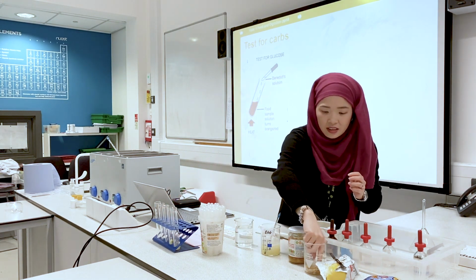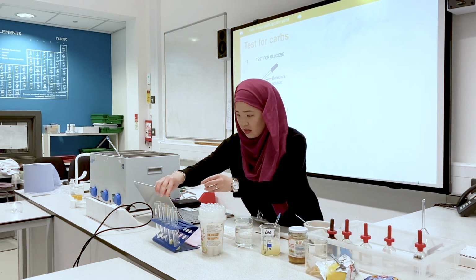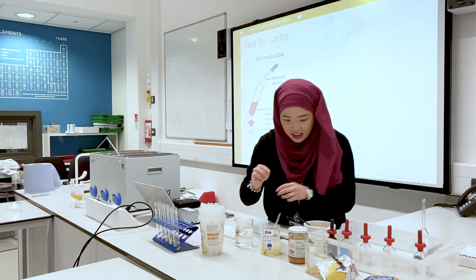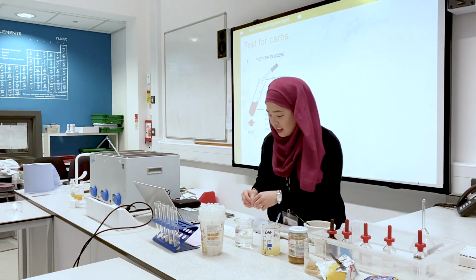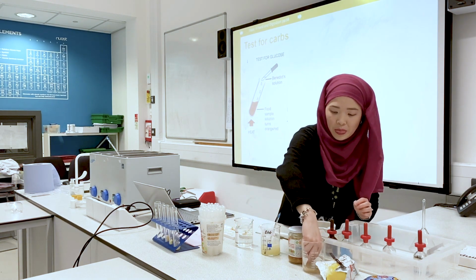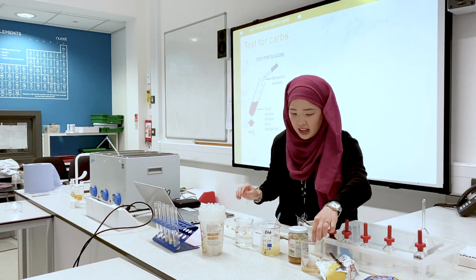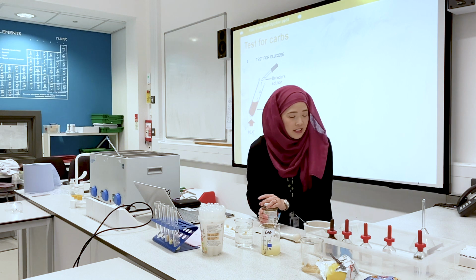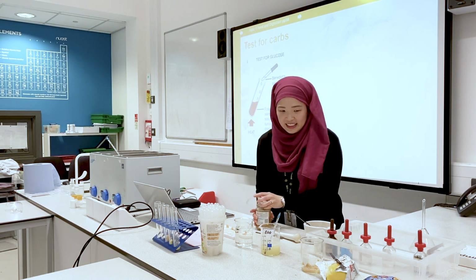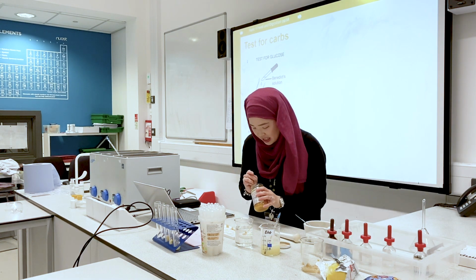I'm going to add pasta. Plunk it in. Okay, almost there. Honey. Okay, going to scoop some honey.